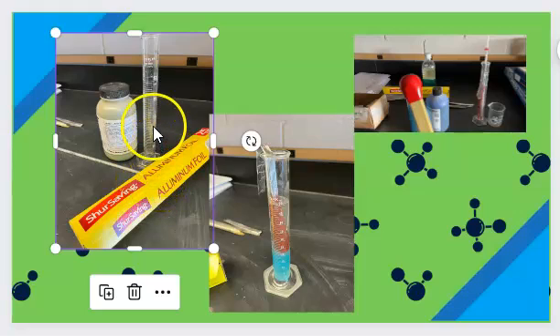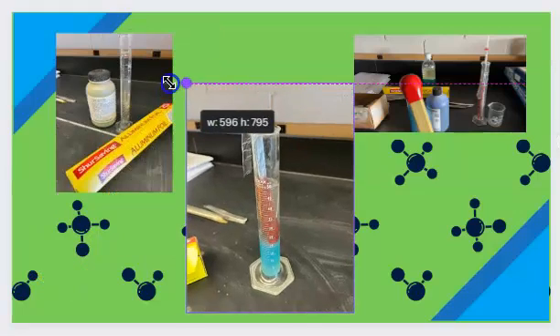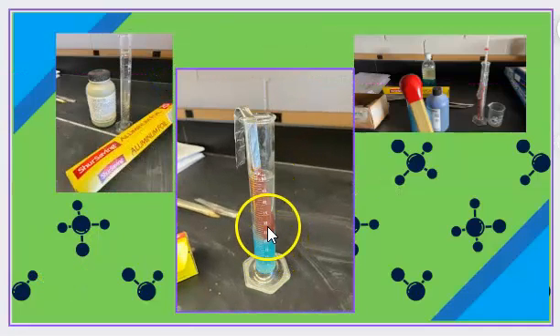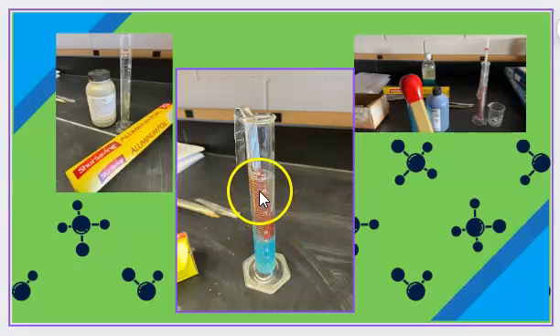And I'm going to go ahead and put it in my copper chloride solution and right away when the copper chloride solution hits the aluminum foil we get that single replacement reaction. It is exothermic. You can put a thermometer in there, have them feel the outside of the graduated cylinder. It gets hot so it's exothermic and you'll see that this copper colored solid that's forming is copper and the copper ions in the solution which are blue are now coming out.